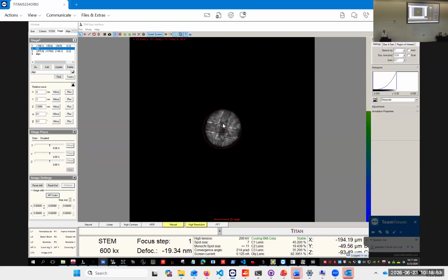We get our fourfold symmetry here of our crystal. Let's move it out by a degree. Let's be adventurous. And you can see we moved it downwards. And here now we can see this center.